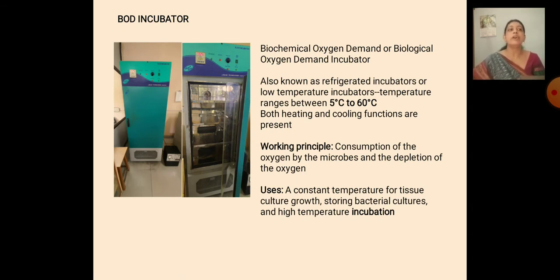Why? Because normally in an incubator which is not a BOD, the temperature over there is 37 degrees Celsius. That is the optimum temperature for the growth of most bacteria or fungi. Here we use a temperature range from 5 degrees Celsius to 60 degrees Celsius.